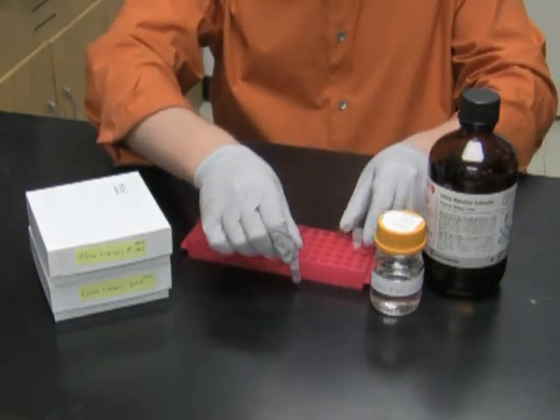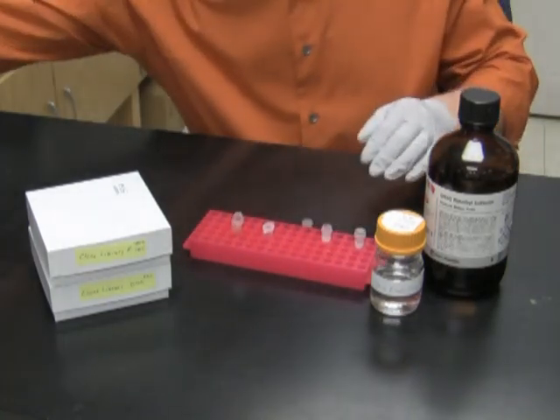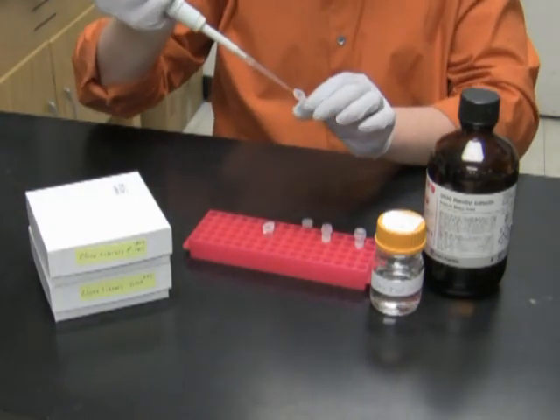And in the second tube I will store the E. coli culture — the one that we saved earlier today, right before starting the mini prep protocol. In this case I will use 900 microliters of E. coli culture.